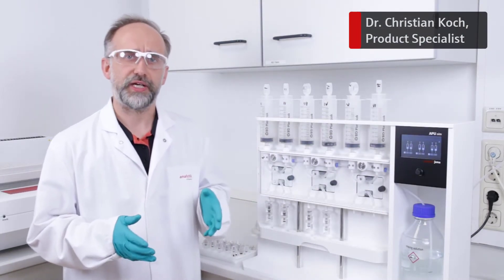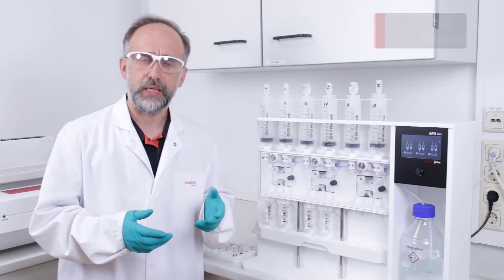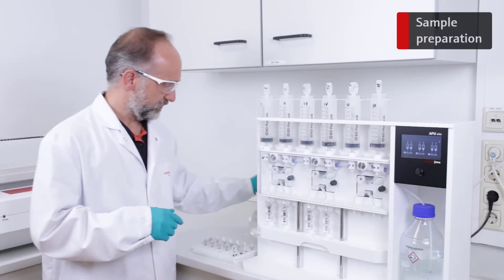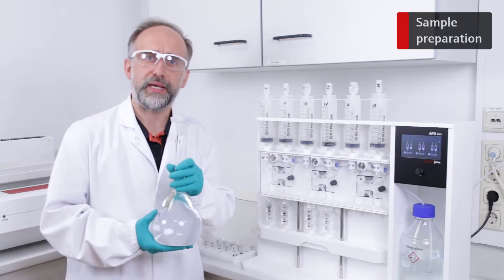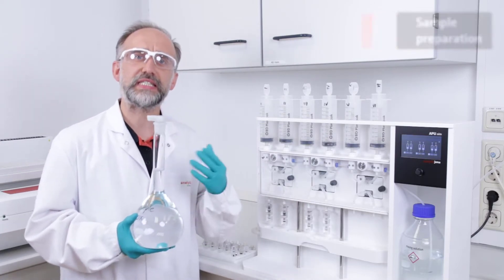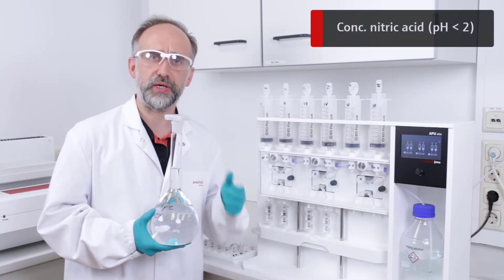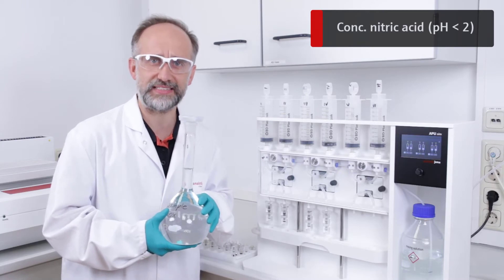Before we start the absorption, it's really mandatory to prepare the sample. The sample itself needs to be prepared in the following way. First, we have to acidify the sample to reach pH 2. This can be achieved by using concentrated nitric acid.